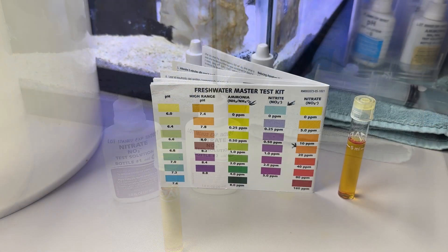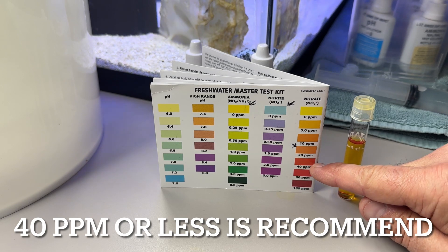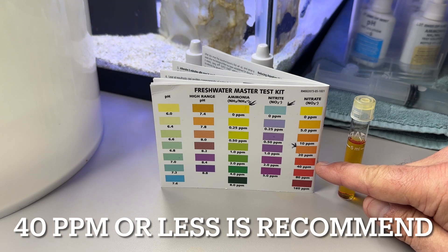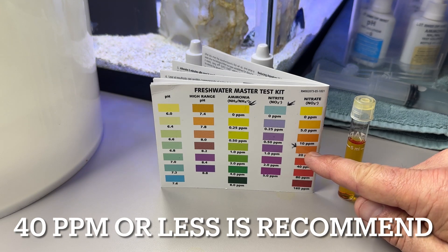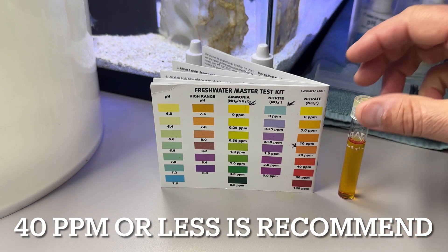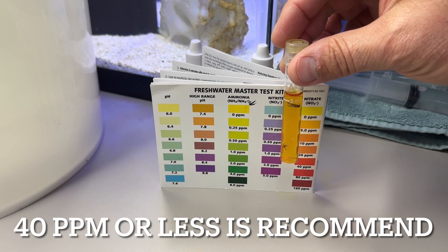Here are the nitrate test results from the kit. The goal is to have it less than 40 parts per million — the red on the right side here. I've put an arrow at 20 parts per million, that's the upper orange bar, and I'd like to keep it less than that myself.